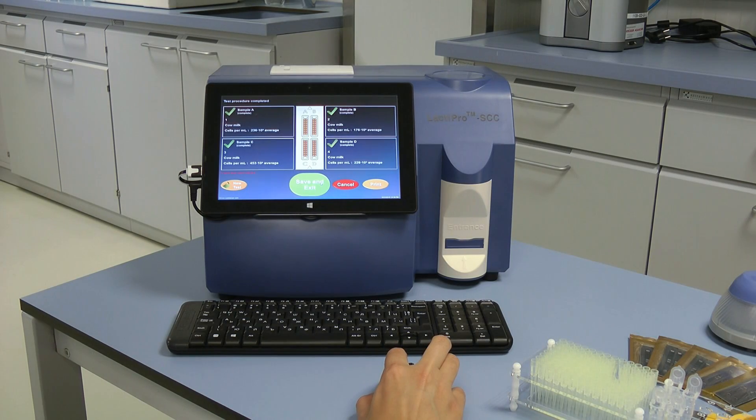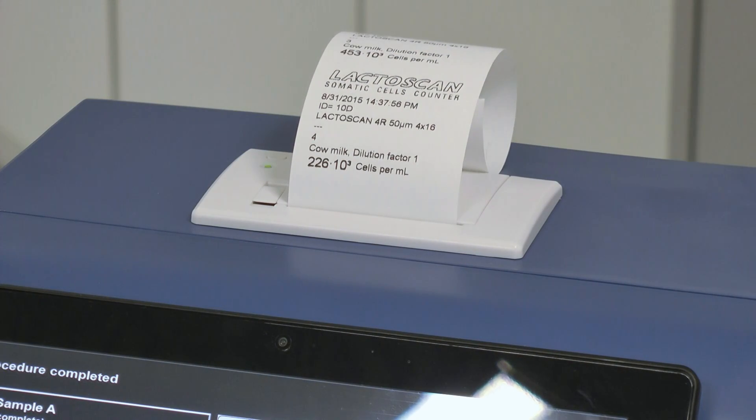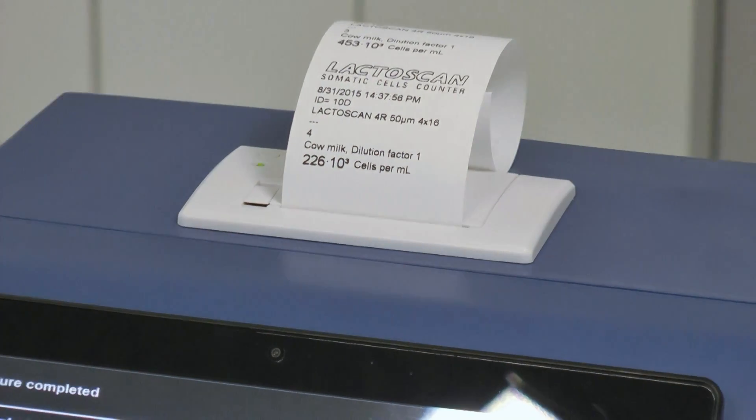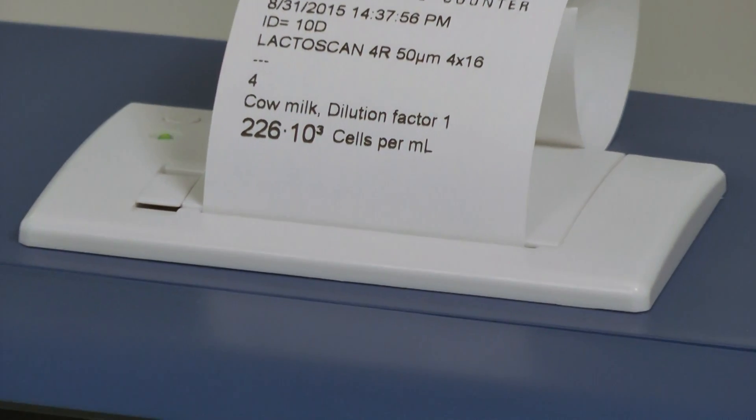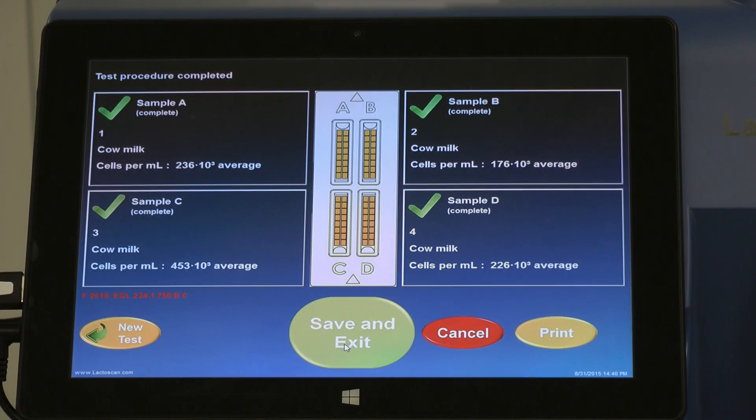When ready, in order to print the results, press Print. It is not necessary to choose a printer or form of printing. By default, it is accepted that LectoScan will print the results on the integrated printer in a short form. Your results are now printed. In order to save the results and continue, press Save and Exit.